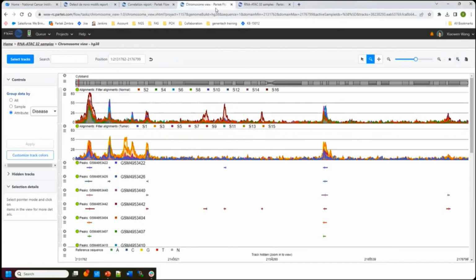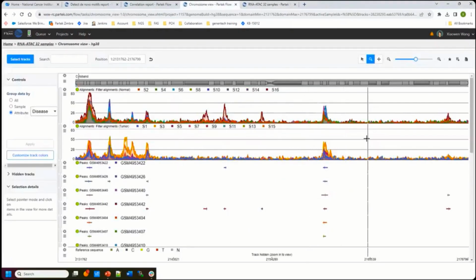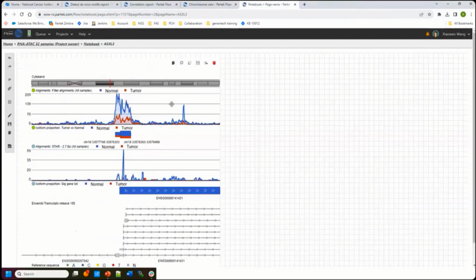Once you close a couple of tabs here, if you want to look at this region again, we have a bookmark. You can always bookmark this, or you can send it to the notebook page to save it. So I saved one in the notebook page, the notebook, not the data viewer. You click on this, and this is what I look for in the region. In this notebook, the picture is dead, but click on this button, which says back to the source. That will make it live.